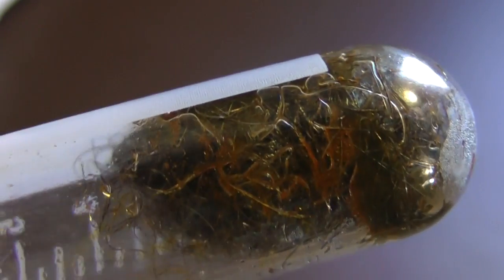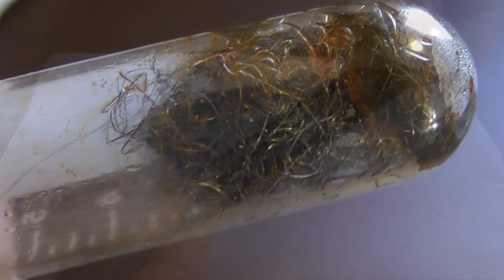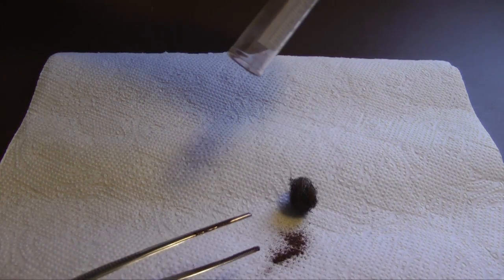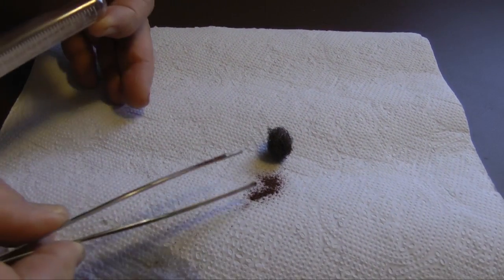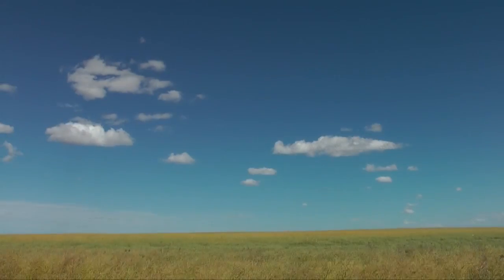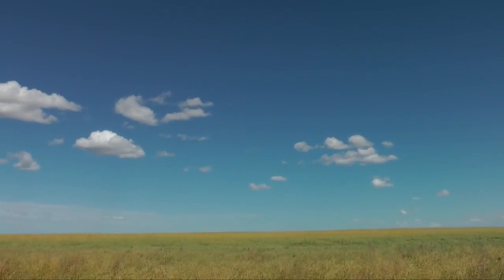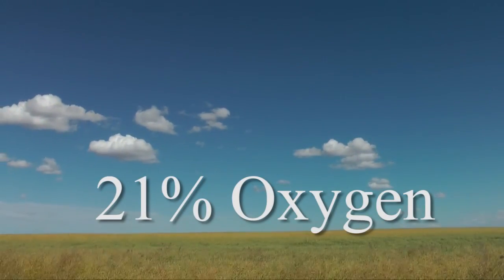The color change tells us that the steel wool has rusted. This sample is fully rusted, flakes of rust falling from the steel wool. With this simple method, we have estimated that air is 20% oxygen, close to the accepted value of 21%.